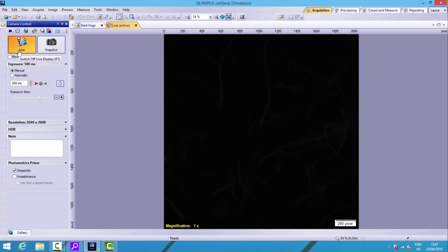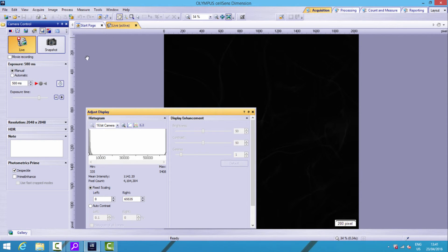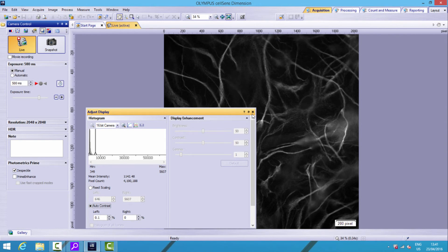So here we've got CellSense. Let's just go live, and let's go to image. Just check 500 milliseconds, image, auto-contrast. Right, now we can see the image.